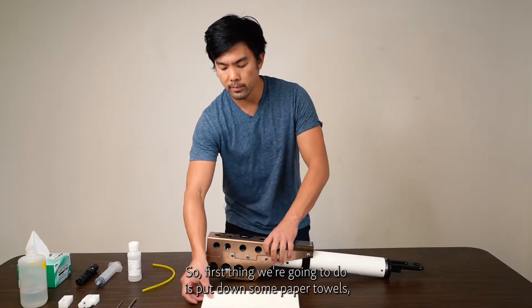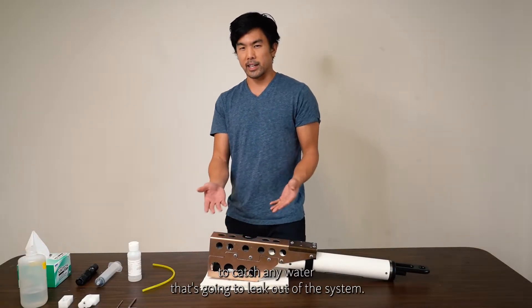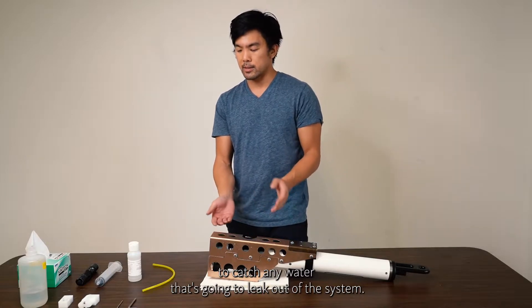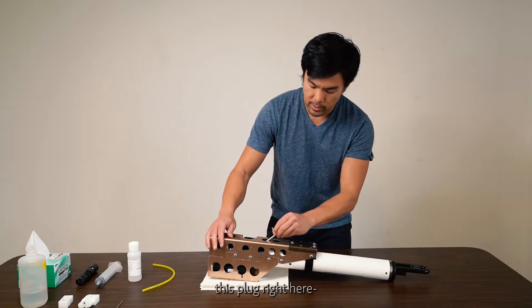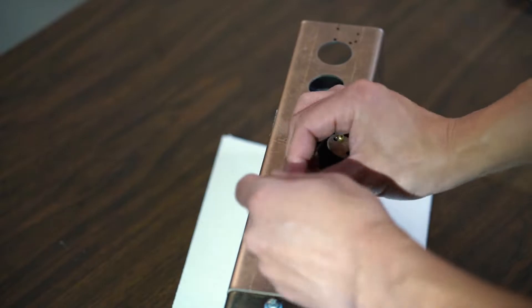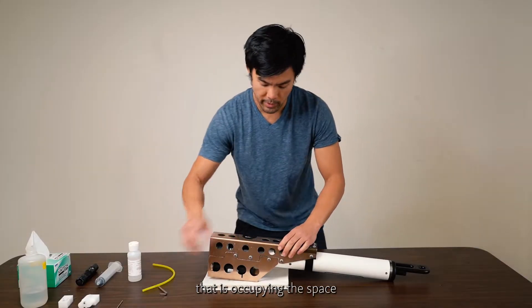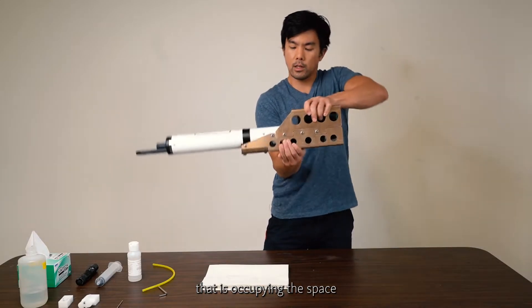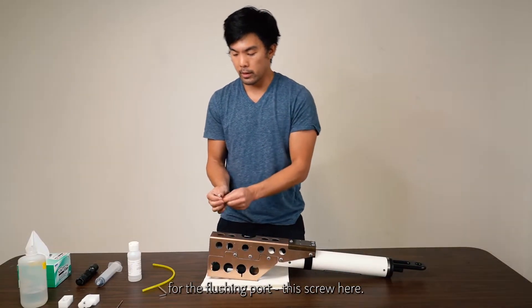First, put down some paper towels or place the unit in a container to catch any water that's going to leak out of the system. Then remove the plug that is occupying the space for the flushing port screw.